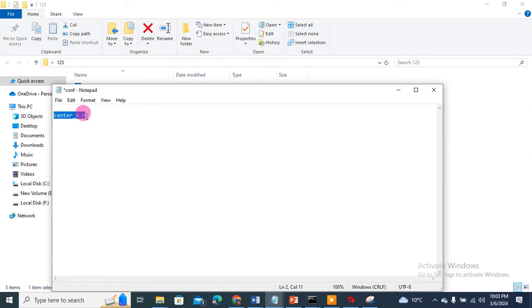Now copy this and paste it 3 times. Okay, change this X to Y, change this X to Z. Now go down, write size_x, again the equal sign, and once again copy this and paste it 2 more times. So Y and Z. A little earlier we made some picture, this one.